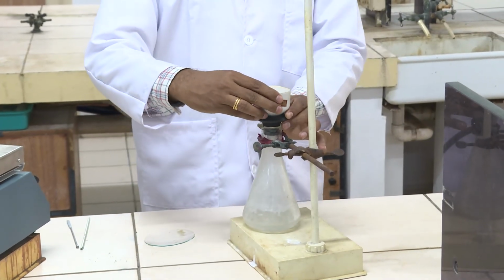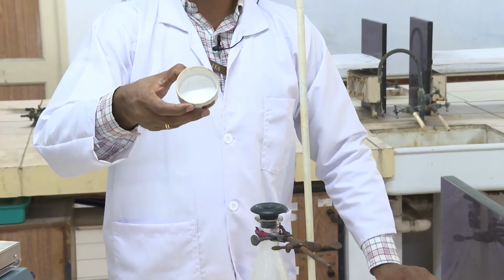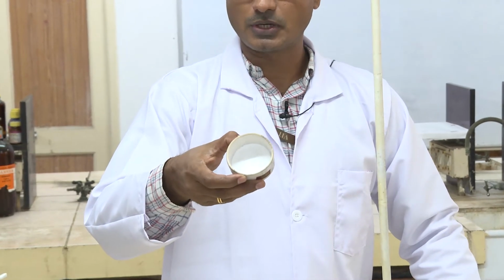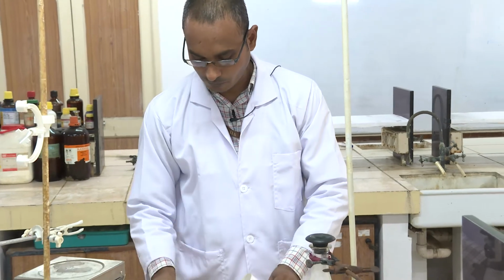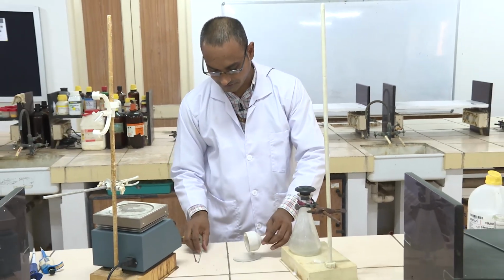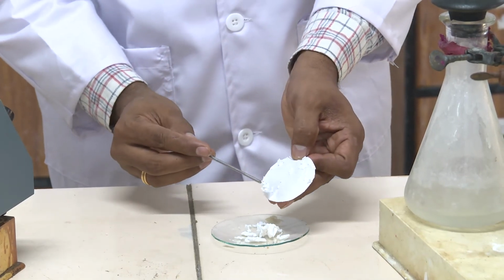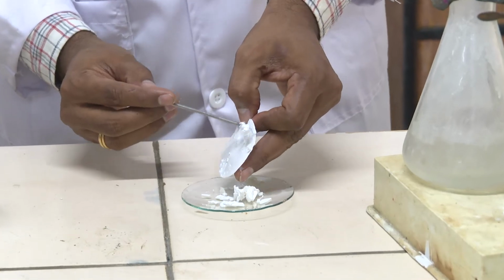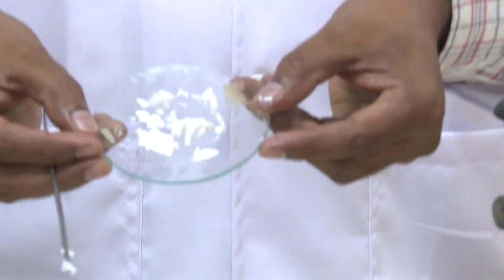Now you are able to see the material, a white colored sol material is there. So now I am going to transfer this material into a watch glass or petri dish. Now I am going to scratch the entire material into this petri dish. Now you can see the material.